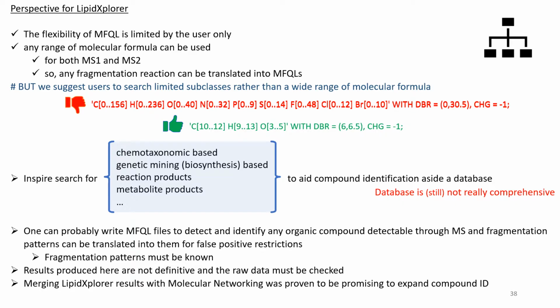Results produced here are not definitive, and the raw data must always be checked, but this is valid for all processing methods. And finally, merging LipidXplorer results with molecular networking, for example, GNPS's case, was proven to be promising in expanding compound identification.